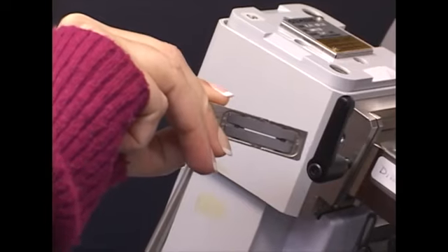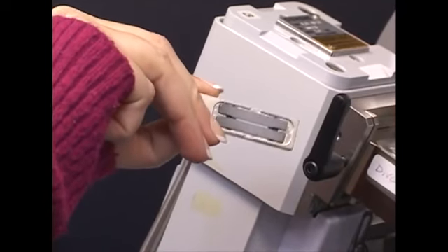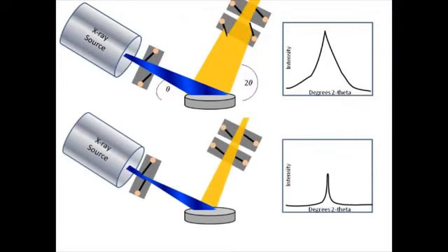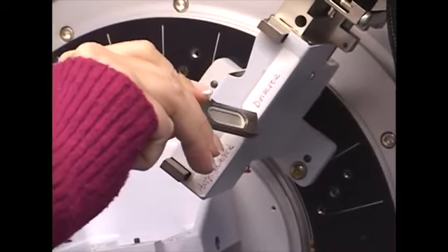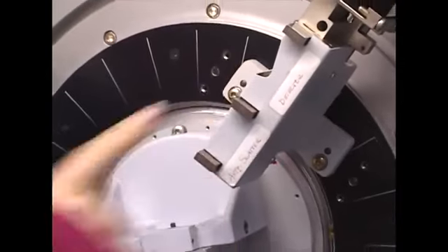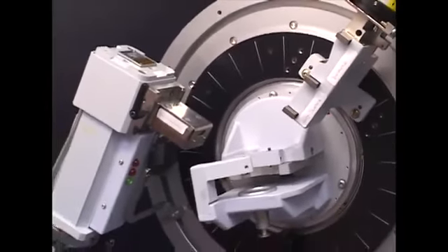The X-rays exit the tube and are incident on the sample from which they are diffracted into a scintillating type detector. The beam passes through a slit which determines the angular width of the beam. Wider slits give more energy but have wider peaks. Smaller slits give less energy but better resolution. The beam also passes through a nickel filter. The nickel filter removes the K-beta energy before the diffracted beam enters the detector.